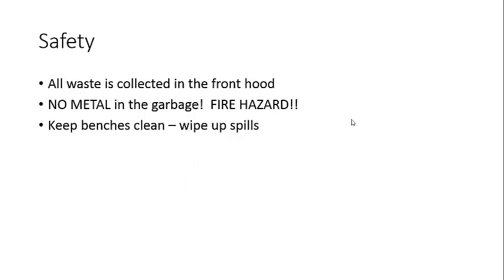Safety. All your waste will be collected in the hood at the front. Very, very important. Please do not put metal in the garbage. Okay, this is a fire hazard. If we have spilled, powdered, or granulated metal, definitely let the instructor know so that he or she can help you clean that up, and we'll probably react that metal before we dispose of it.